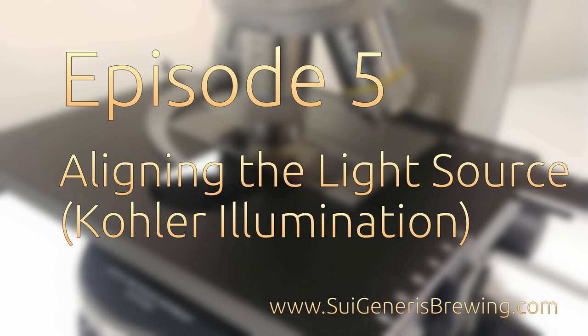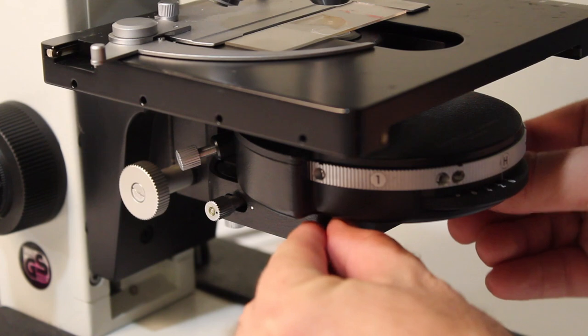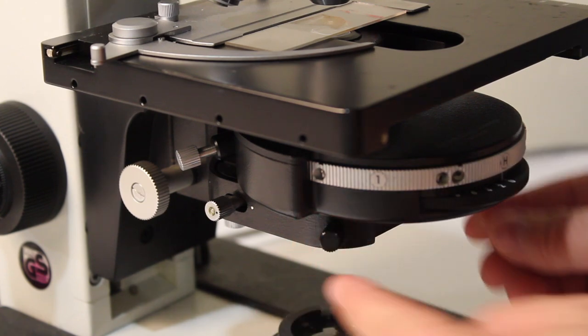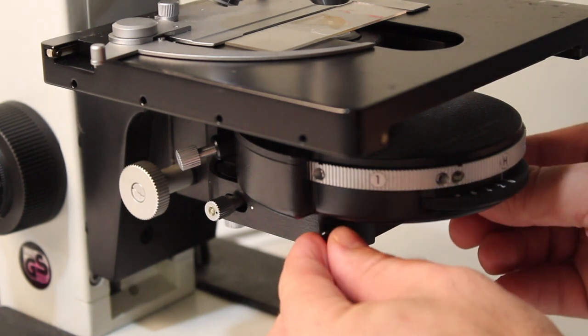Welcome to Episode 5 of Microbrews, my new video series on how to make the best use of a microscope in your home or craft brewery. In this episode we will be demonstrating how to align the illumination optics of your microscope.